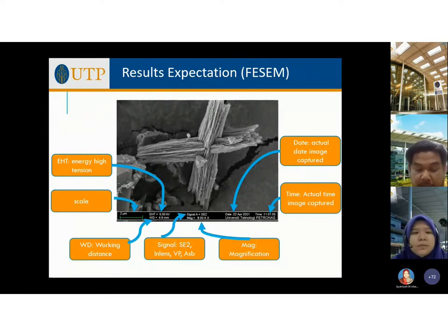Other information is the date. This is the actual date captured, and also the actual time captured. When we capture the image, this data is all recorded together.